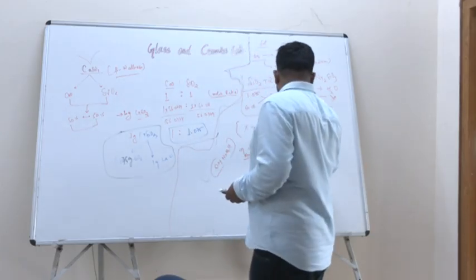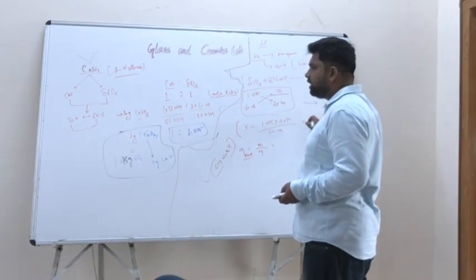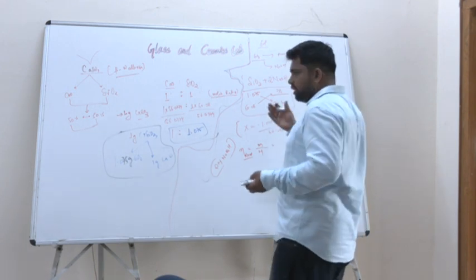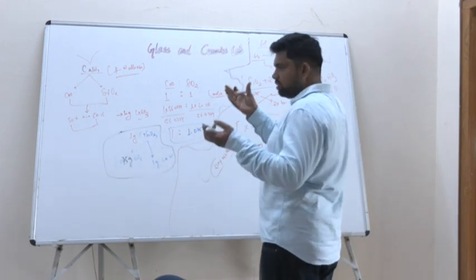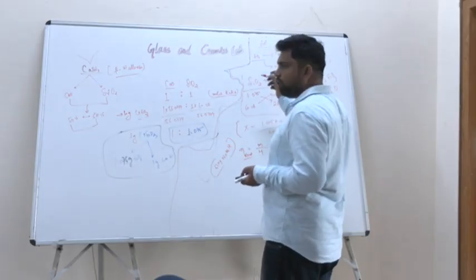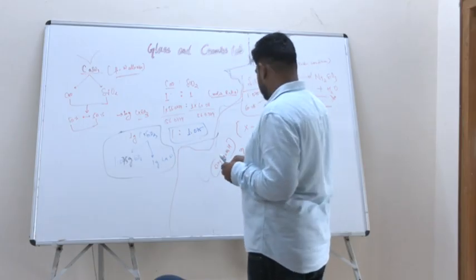So we got the value of NaOH, which is in solid form, but we need it in liquid form. So we will dissolve it in water, but that solution should have some strength. That strength is 2 molar. M is for the strength of the solution, molarity.